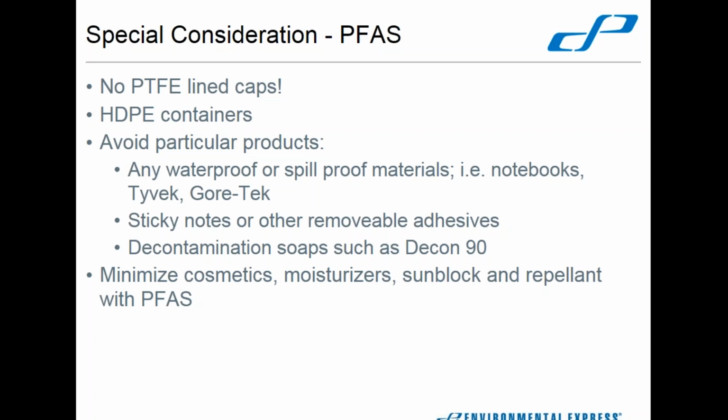Per or poly, I believe both of them apply, fluoro something something. This is totally opposite of almost everything else that you are doing with your normal sample considerations. You do not use PTFE lined caps. PTFE is actually some of what will show up in the PFAS scan. The regulations call for HDPE containers.